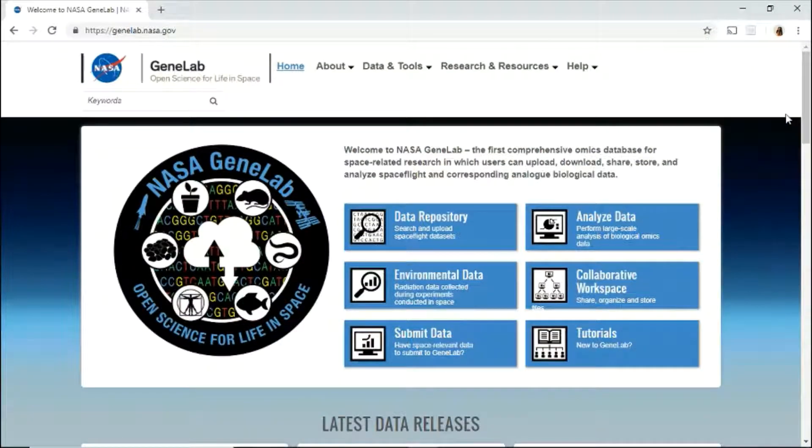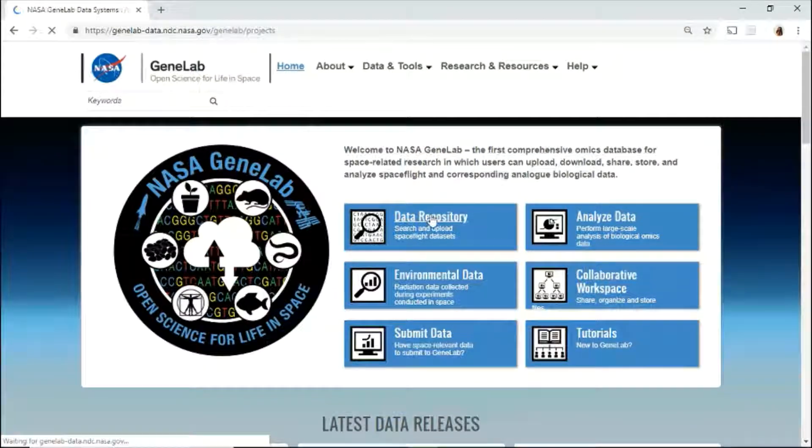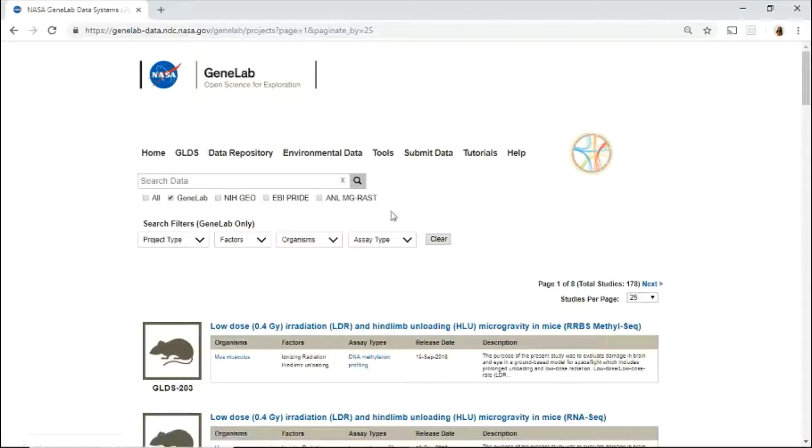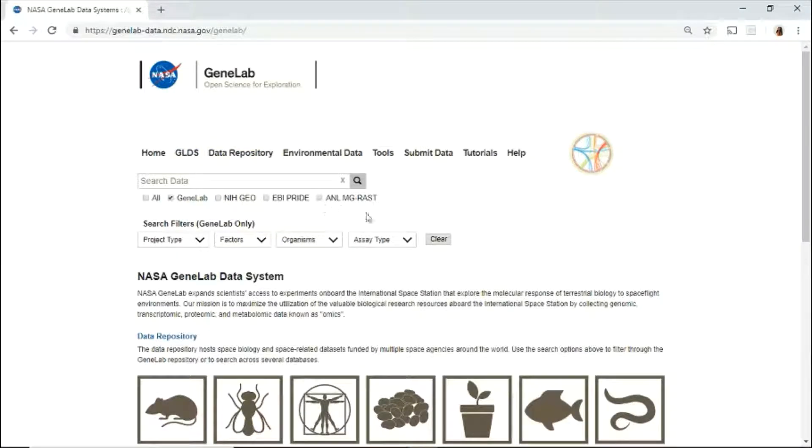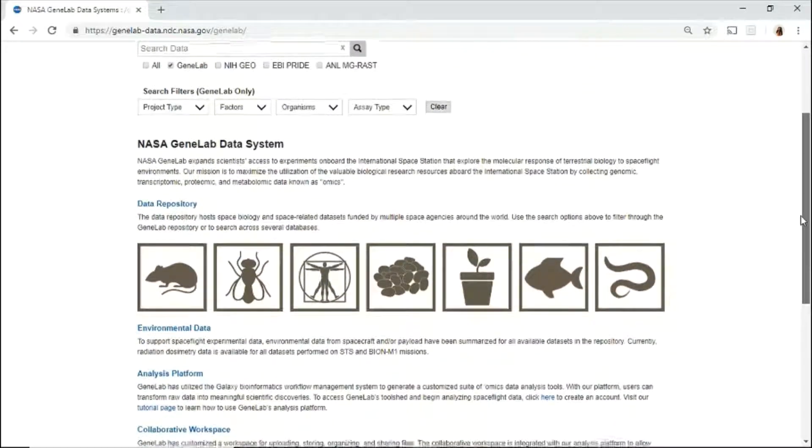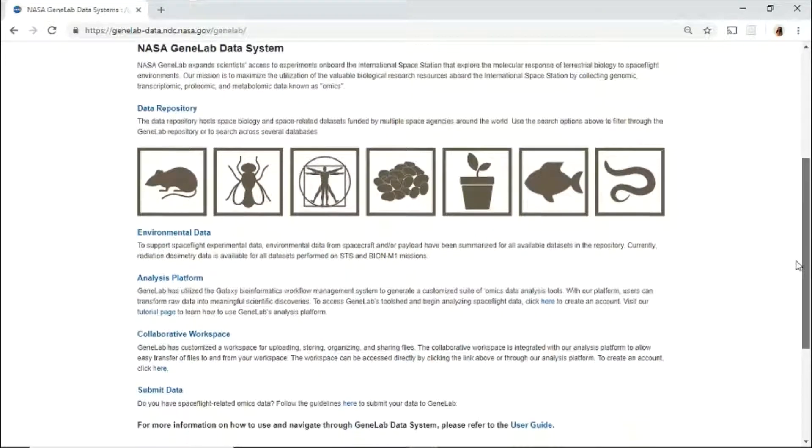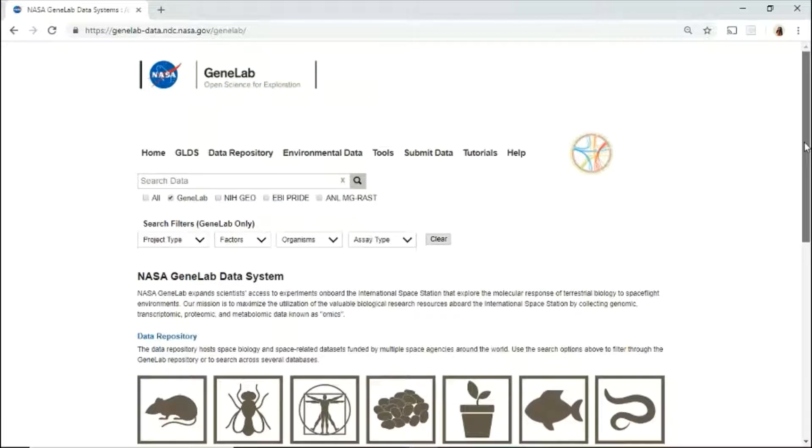Let's now explore the GeneLab data systems. On the GeneLab data systems, or GLDS, you'll find a description about the data system, types of data, tools, and how to submit your data. Use the top menu to navigate through the different spaces.